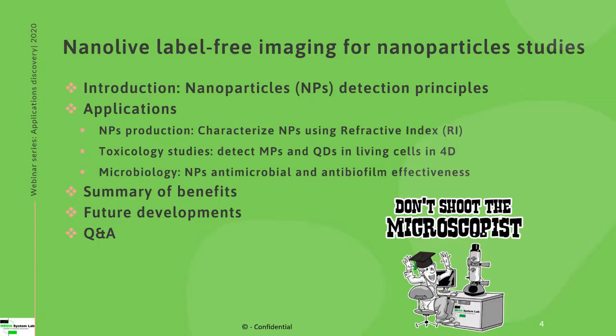And at the end, we are going to see some applications in microbiology, due to the fact that these nanoparticles also have effectiveness in the field of antimicrobial and antibiofilm. At the end, we are going to have a general overview of the benefits of the technique, and we are going to see the future developments.